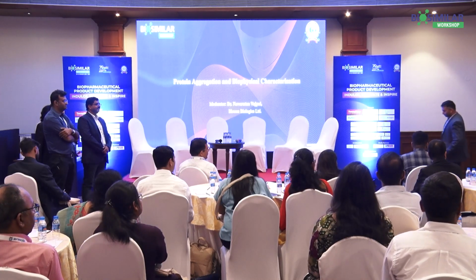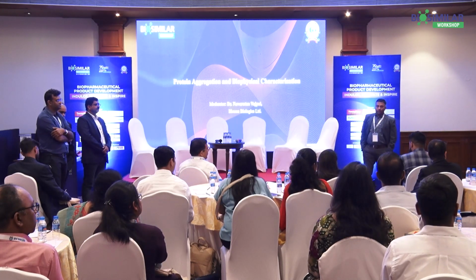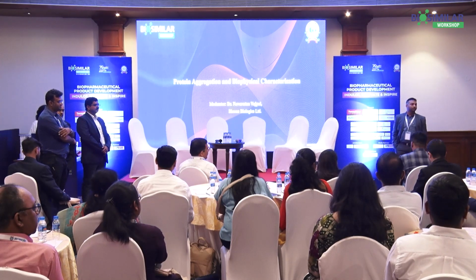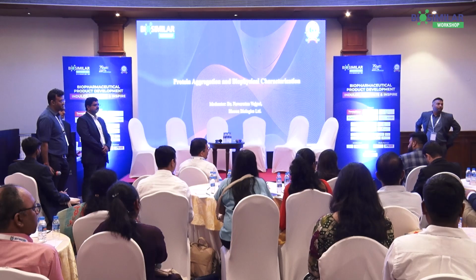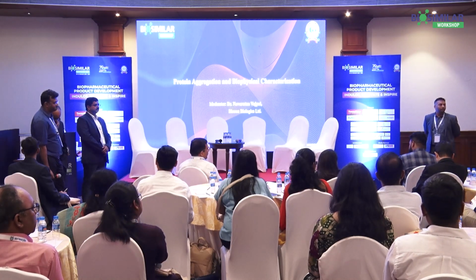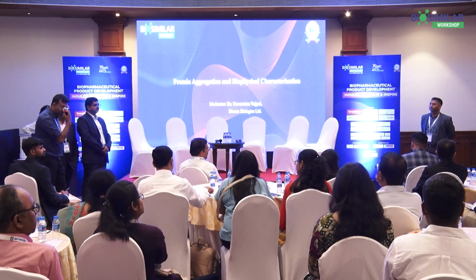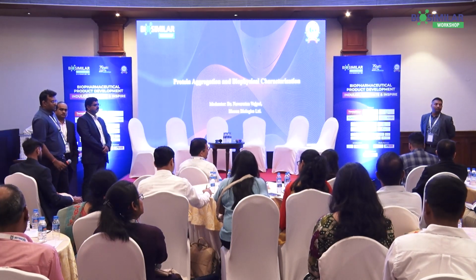Hi, thank you for the talk, and myself Smita from Merck Life Science. My question is with respect to high concentration mAb formulations. Viscosity is a major challenge, but I could not see the test for viscosity in the analytical methods you have enlisted.